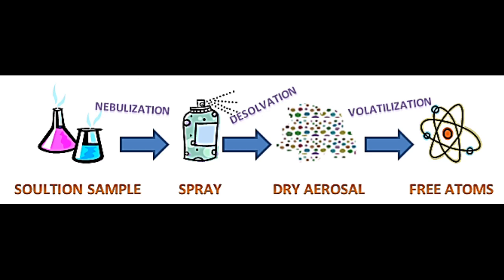The most common continuous atomizer in AAS is a flame, and the most common discrete atomizer is the electrothermal atomizer. Sample atomization limits the accuracy, precision, and limit of detection of the analytical instrument. The purpose of the atomization step is to convert the analyte to a reproducible amount of gaseous atoms that appropriately represents the sample.